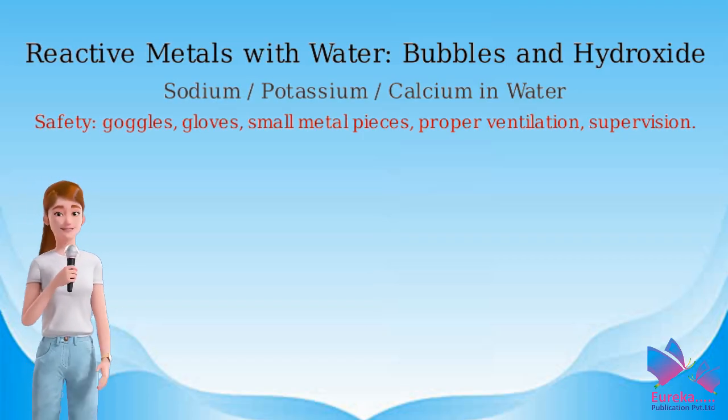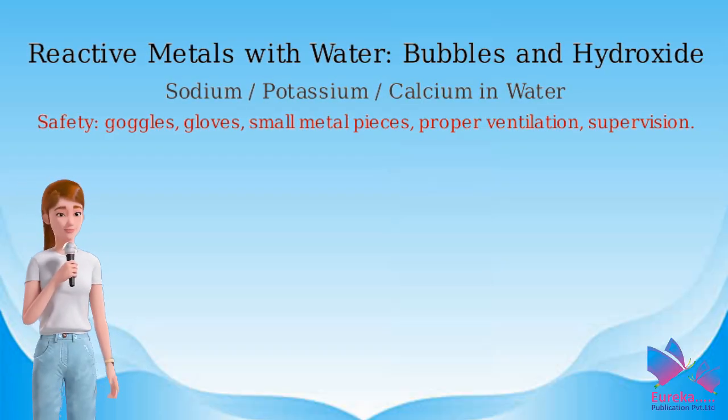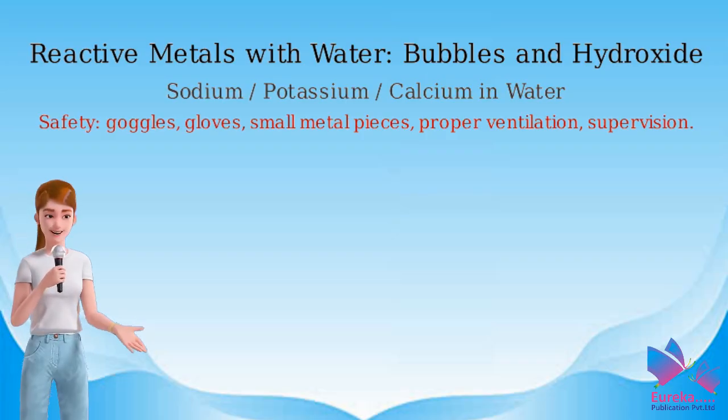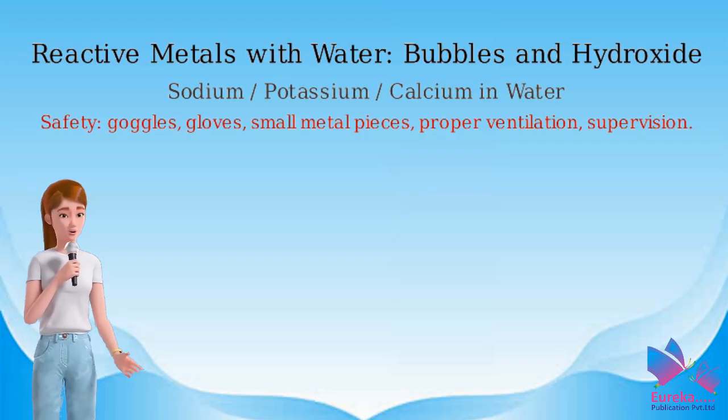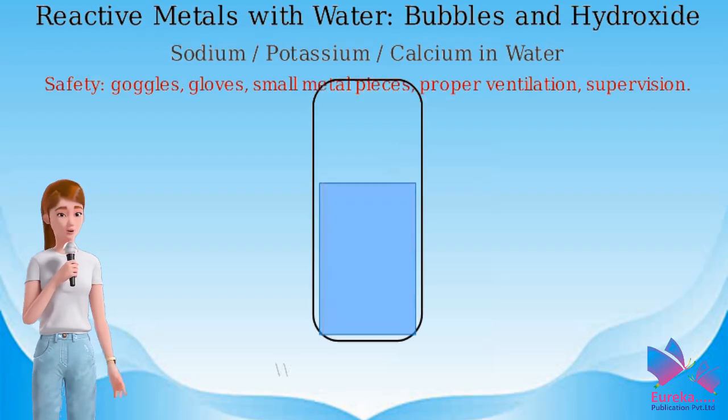Always follow proper laboratory safety. Wear safety goggles and gloves, use small pieces of metal, and perform the reaction in a controlled lab setting with adult or instructor supervision. First, we set up.